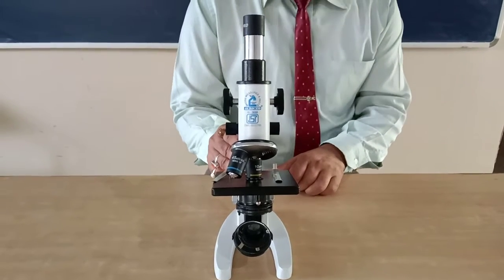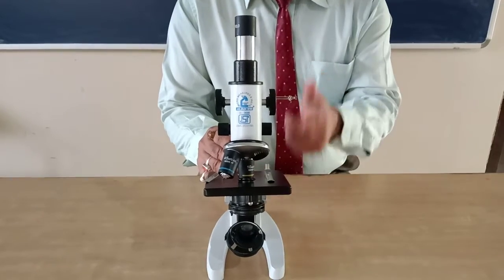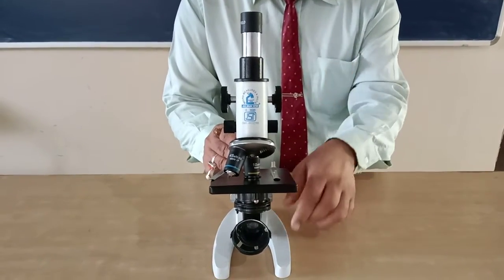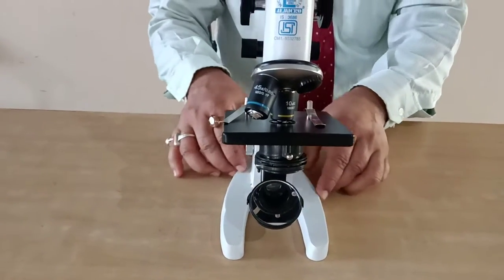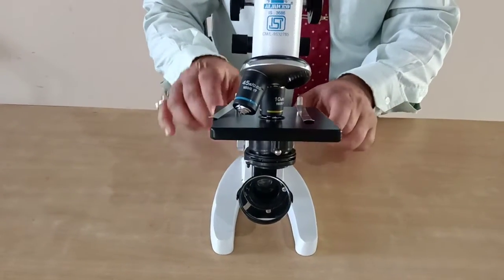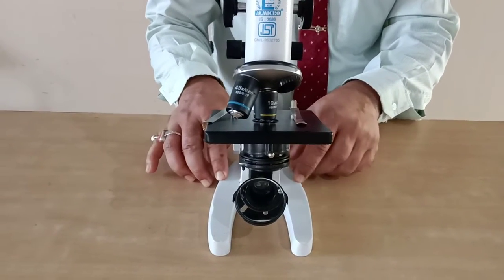Okay. So now let me discuss the parts. Let me move from bottom to top. Understand? So now this is called foot. This is called foot, or base. So its base is there. This is the base or foot. It looks like a horseshoe.